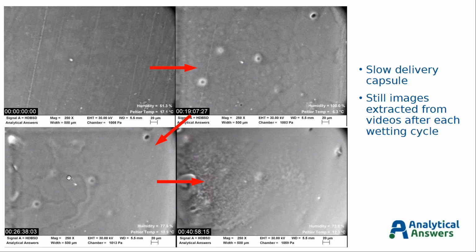After a second wetting cycle, we could see that some of those patterns were reinforced, whereas some others are much fainter than they were the first time, with a little heavier wetting. Then we finally went through the full dissolution or full wetting of the sample for a more extended period of time, and completely dissolved away all of those surface features we had observed in the first place. But we did observe some new micro features on the scale of less than 20 microns.